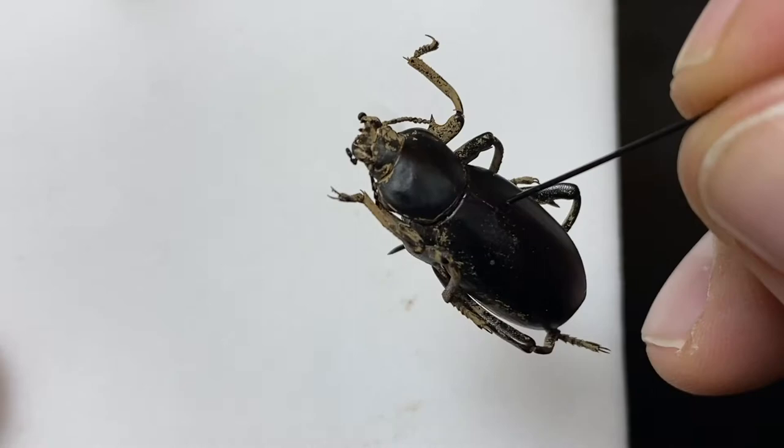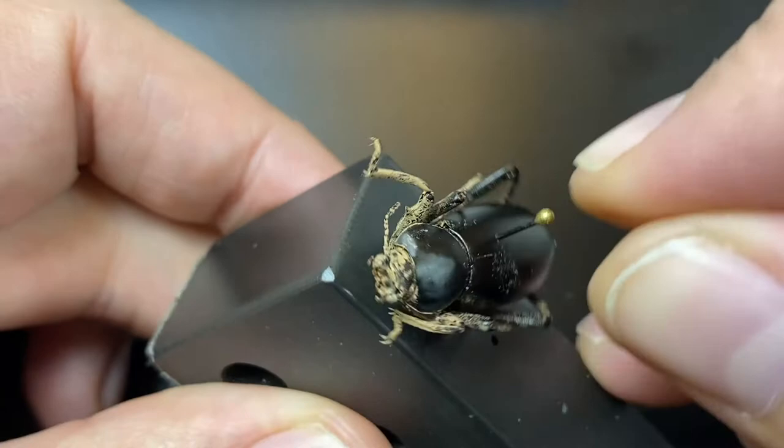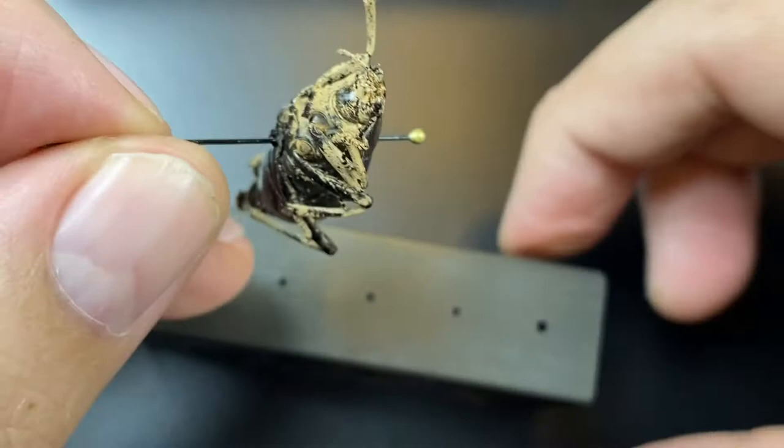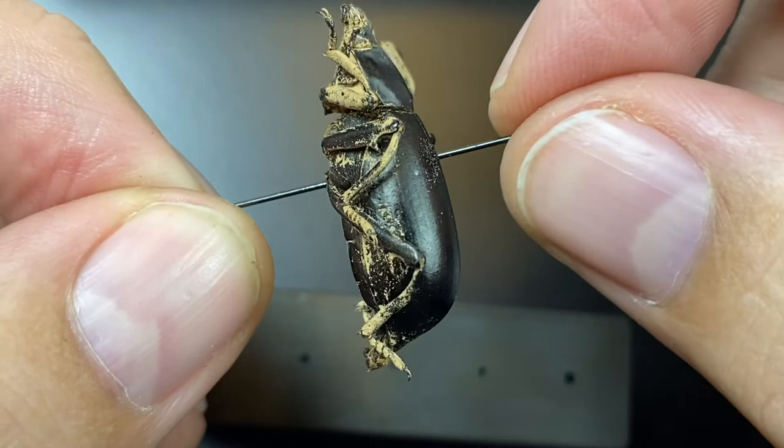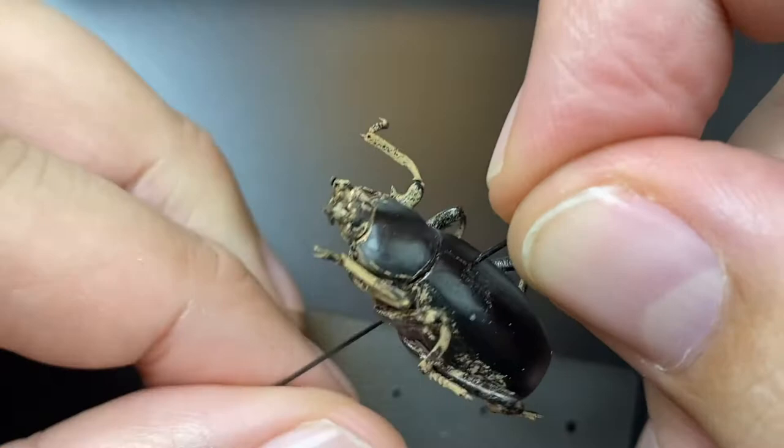We come over here and put this in the pinning block. We want to make sure that we leave enough room up here to grab the specimen, and that is what the short hole that's a little bit wider is for on most pinning blocks. You want to make sure there's about 10 millimeters — about a centimeter or so — to grab it. Personally I like it to be just a touch higher than that, but you don't want it all the way up to the head of the pin. You do want someone to be able to come in and grab the specimen without damaging it.